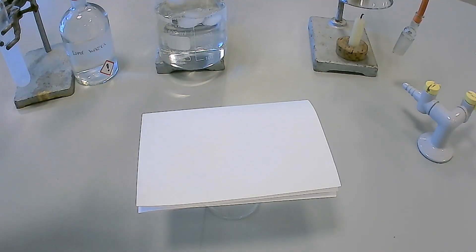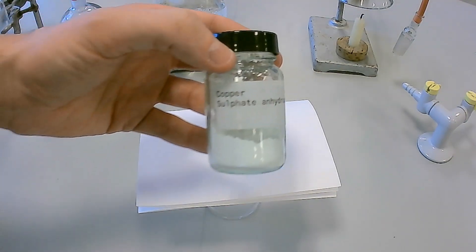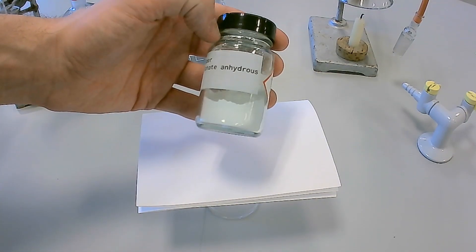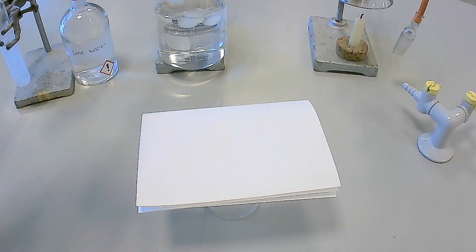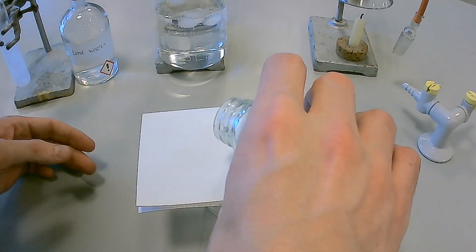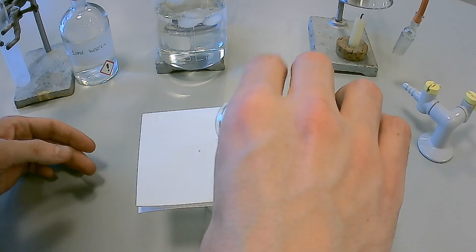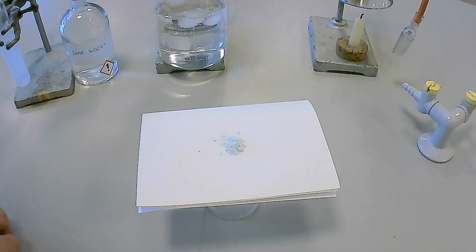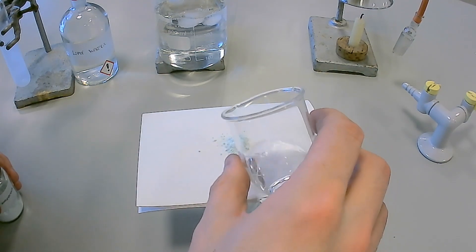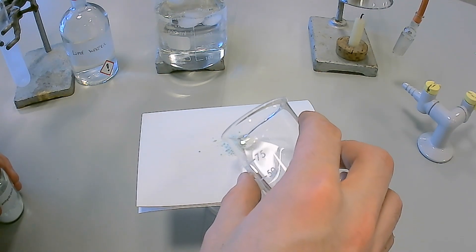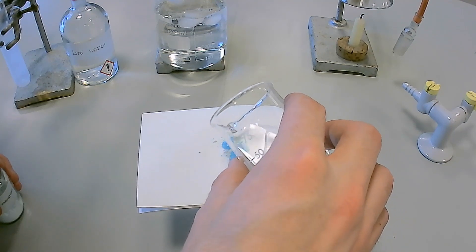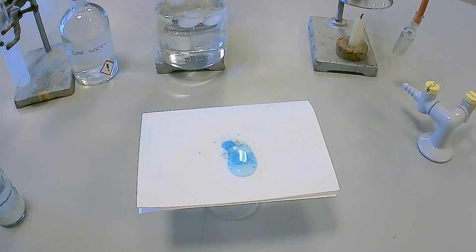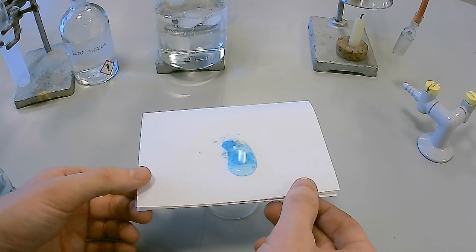An alternative test for water besides using cobalt chloride paper is to use anhydrous copper sulphate. On the addition of water, this white solid turns blue in color due to the formation of hydrated copper sulphate. The equation for this reaction is shown on screen now.